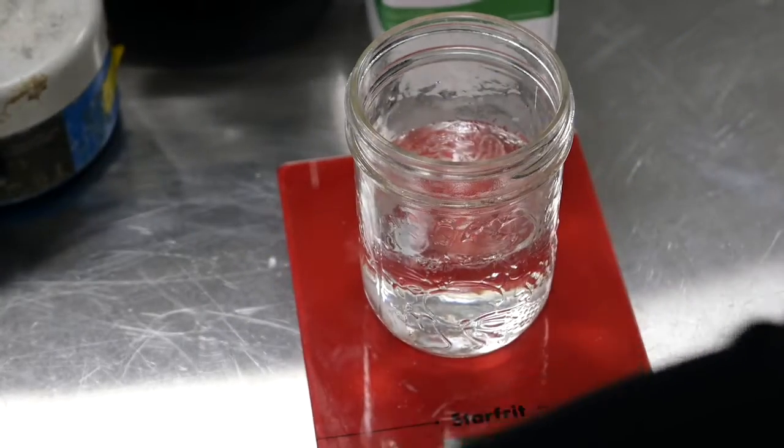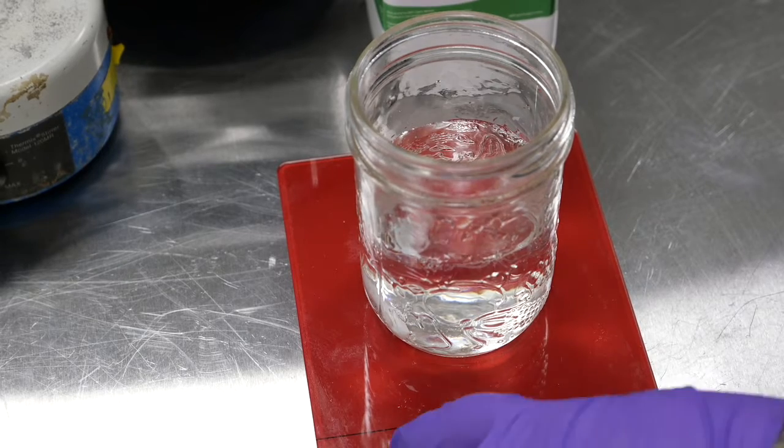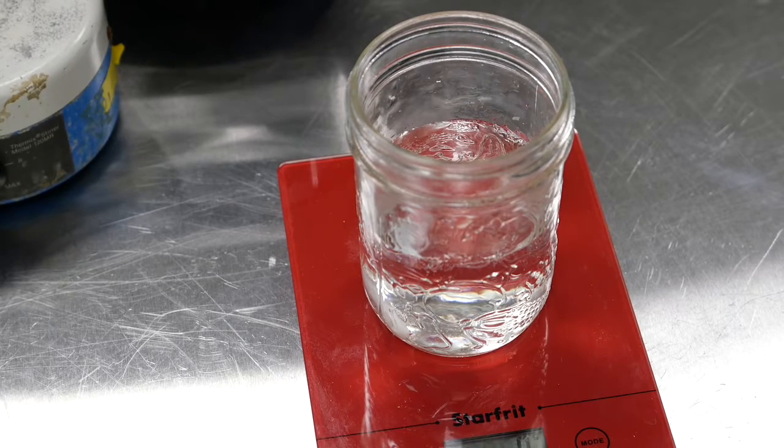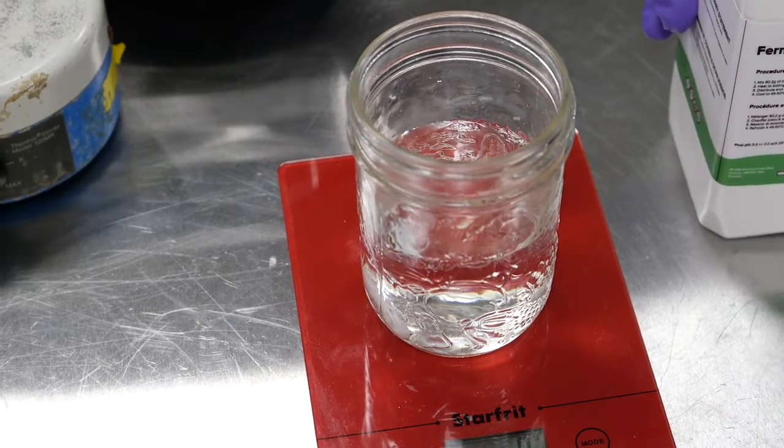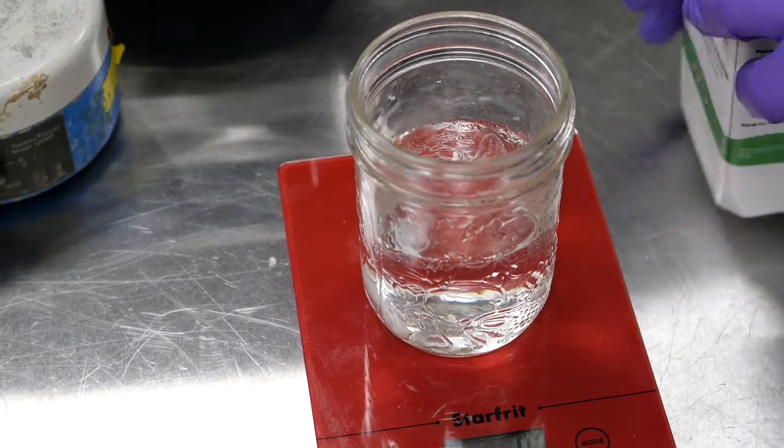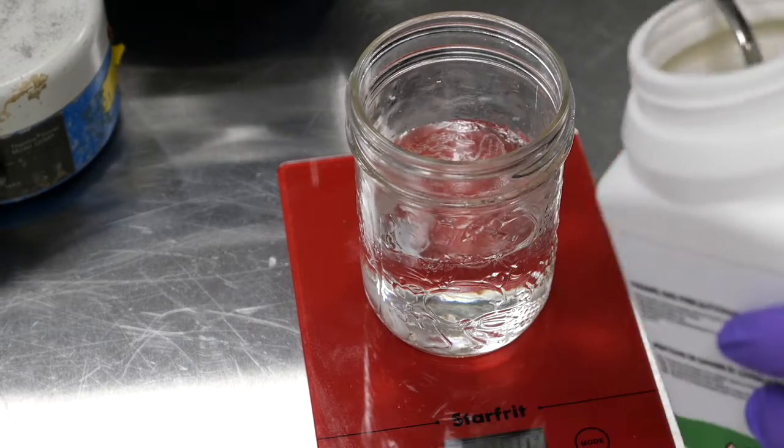And then I'm going to zero that. In this case, we need 80 grams for one liter, so we know we need 20 grams for that quarter liter. So I'm going to use a spoon to weigh that out.